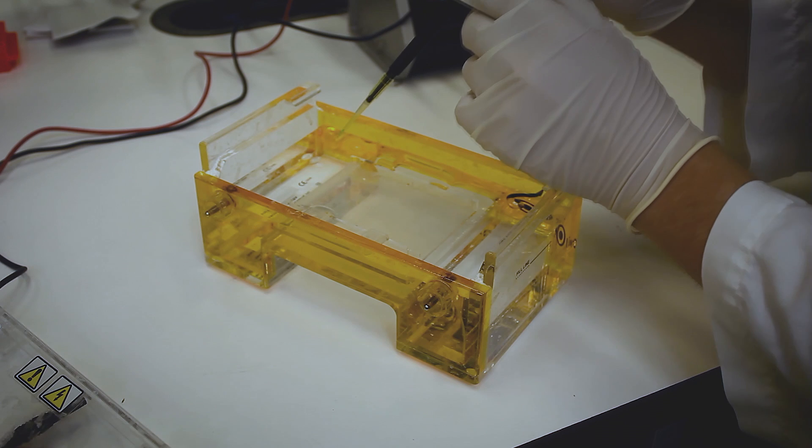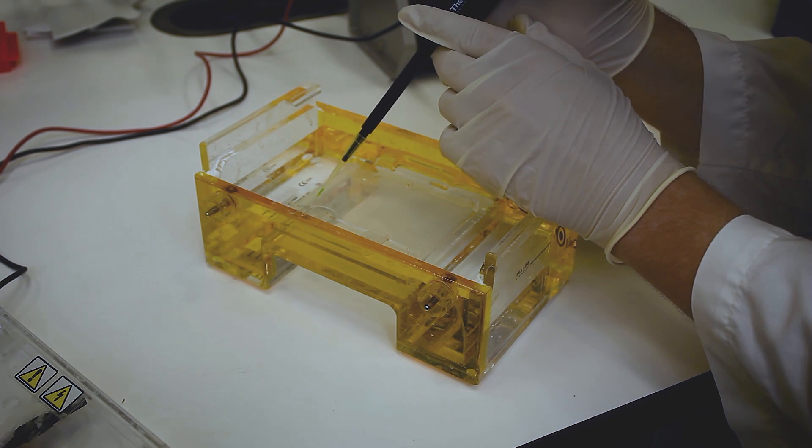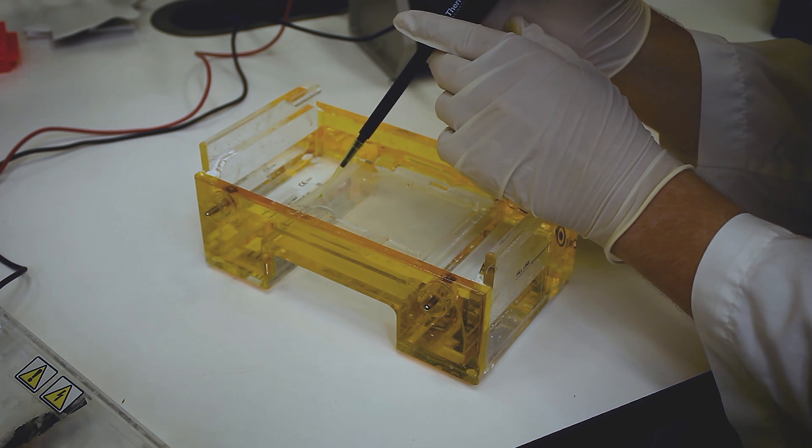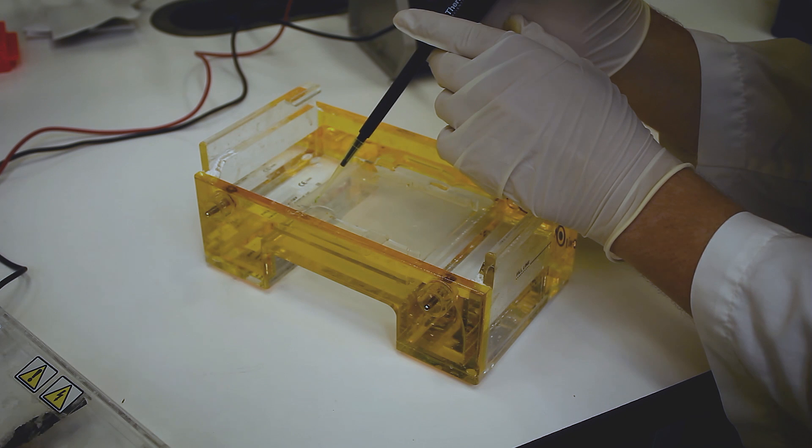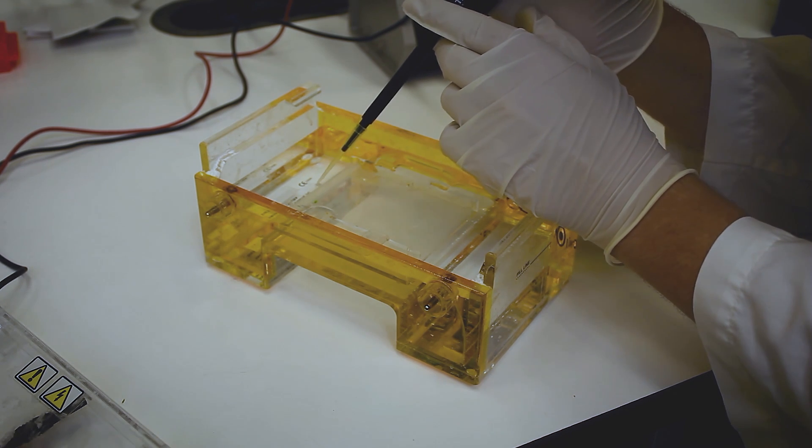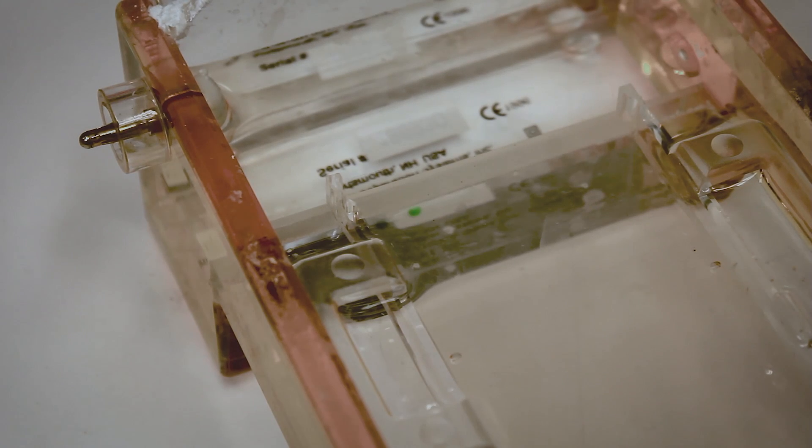GoTaq Green already contains loading dye so you do not need to add loading dye to the DNA. If your PCR product is missing loading dye, add 2 microliters of loading dye to 3 microliters of each PCR product.